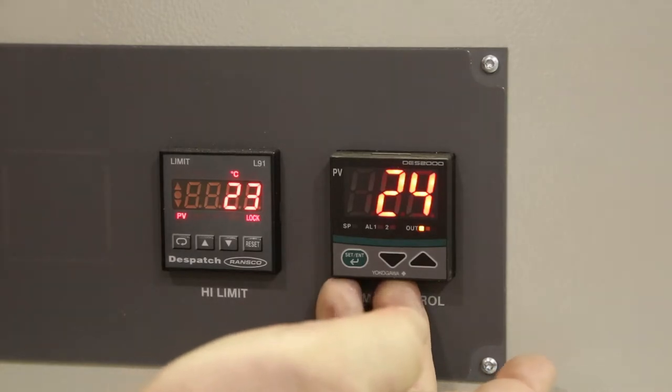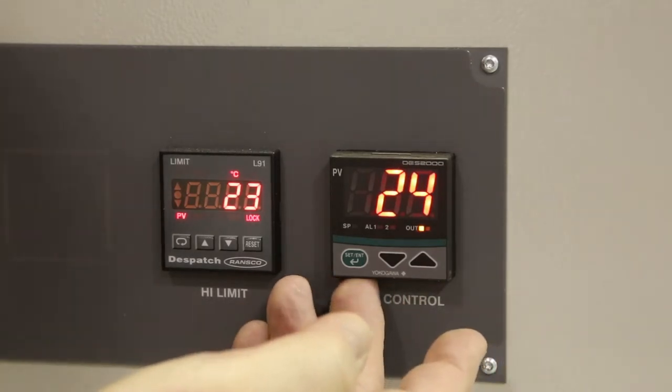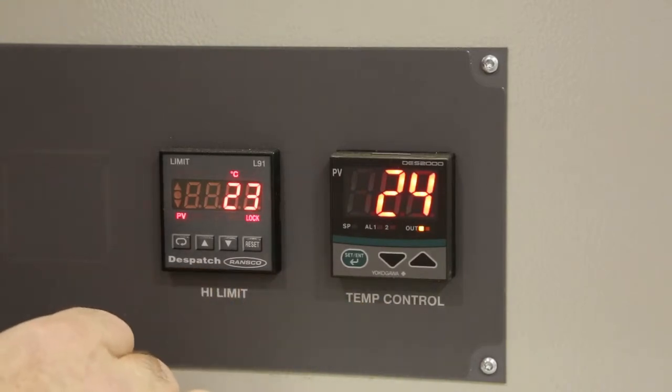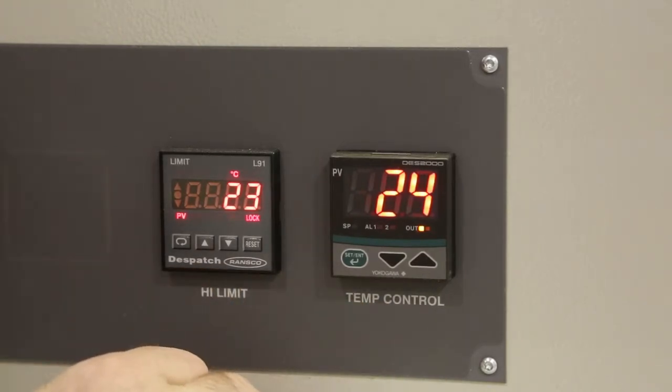This is the DES-2000 controller utilized on Despatch's LBB series of ovens. This video will show you how to check the configuration setups.